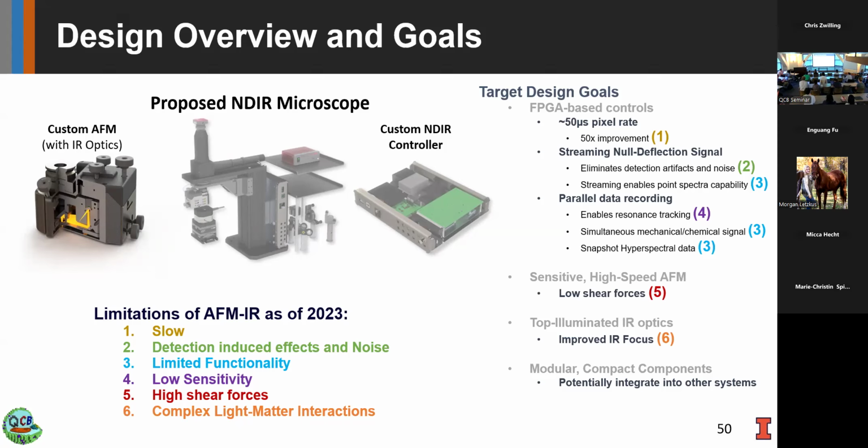It's all embedded in here, so it's fixed and it shouldn't change per wavelength because it's coming through a hollow core fiber. So no need to align each wavelength independently. And it's very compact compared to the original system, which takes up the size of this table. This little AFM objective can be integrated into basically any microscope system.